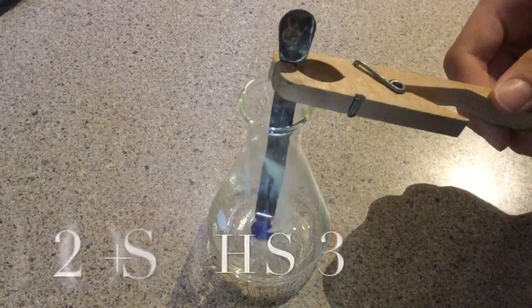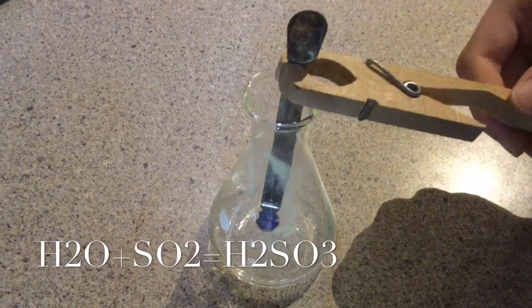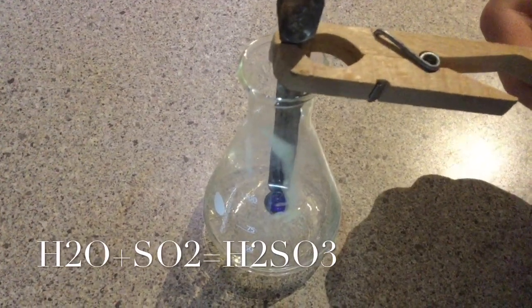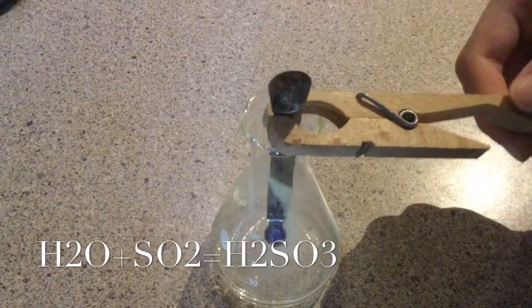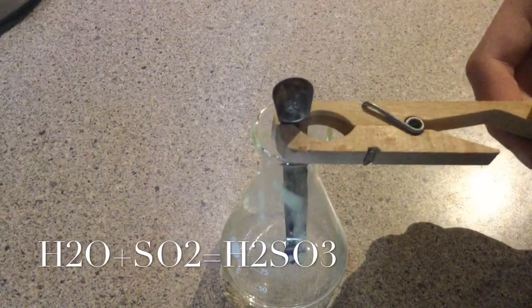Wow, look at that fog! What's actually happening is that the water is mixing with the sulfur dioxide to create sulfurous acid. Look at the formula below — you see the H₂O, that's water, while the SO₂ is sulfur dioxide. When you add the two chemicals together you get H₂SO₃, also called sulfurous acid.